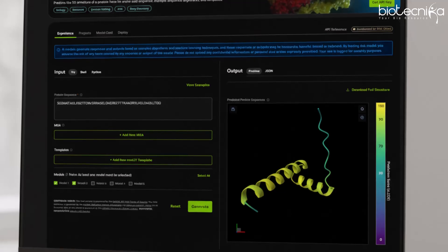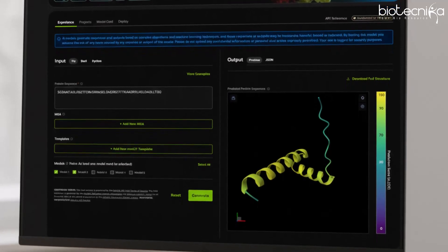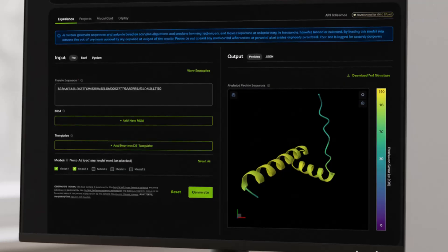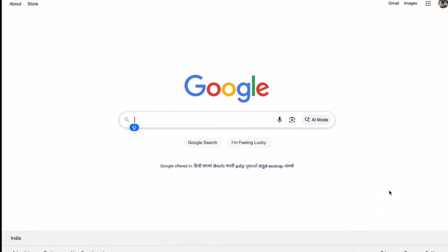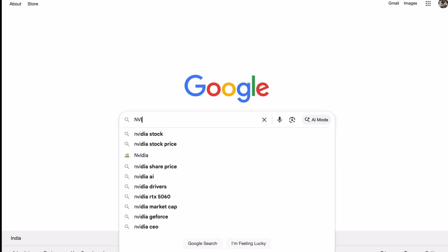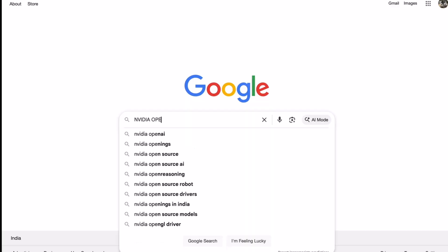The name of that particular server we are going to use today is NVIDIA-based, and you can directly type in the name of the tool as well. There are multiple tools in this particular server, namely AlphaFold, OpenFold, EMFold, and BoltzAlphaFold. Whatever tool you are going to use, you can just directly type in NVIDIA and the name of the tool. In today's demonstration we'll look at OpenFold 2, so we'll directly type in NVIDIA followed by OpenFold 2.